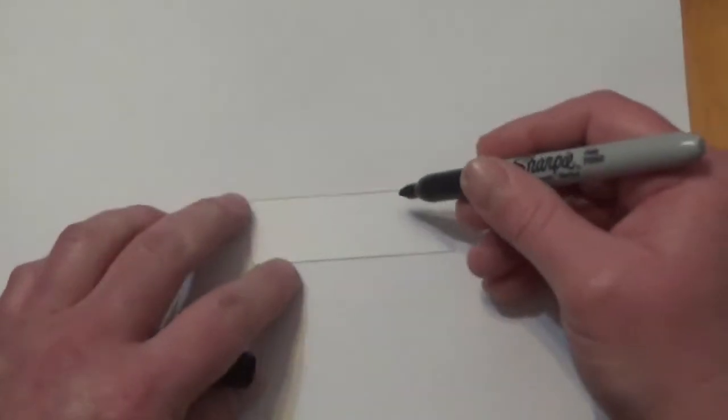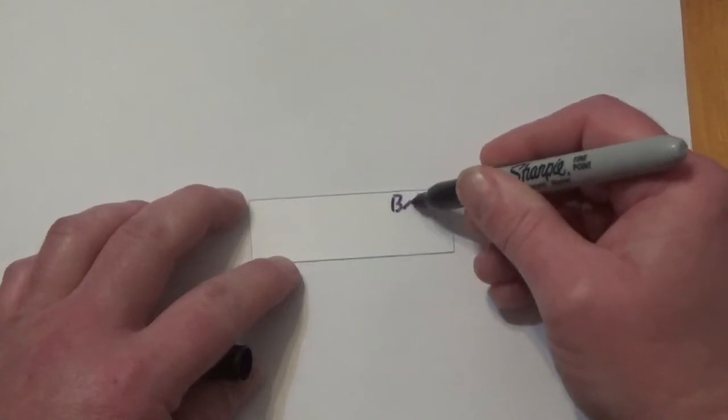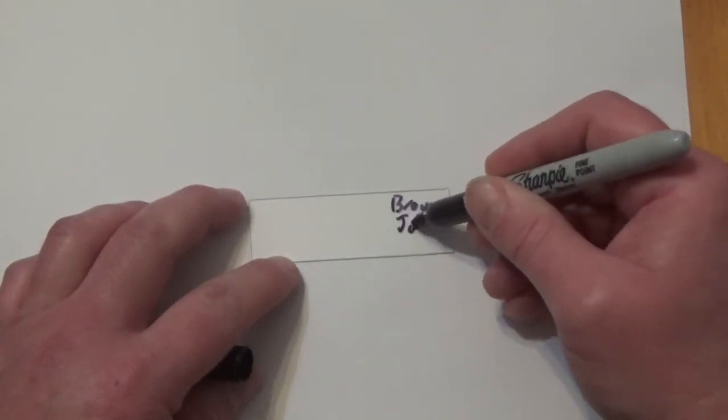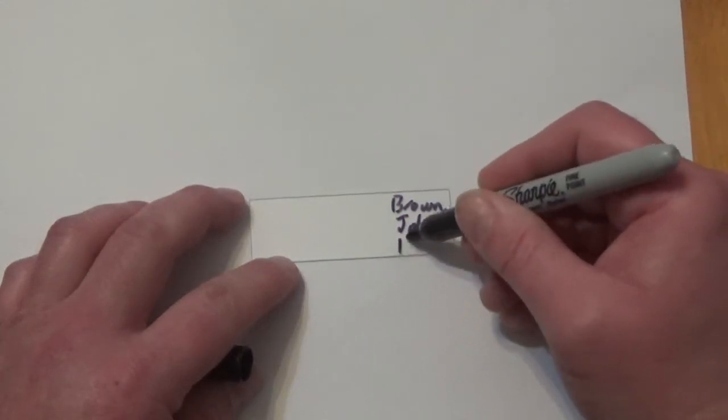We're going to use a clean surface and a clean microscope slide, which we're going to label. We'll be testing my hair and my dog, Snoopy, so we'll just label this Brown John, and I'm human.